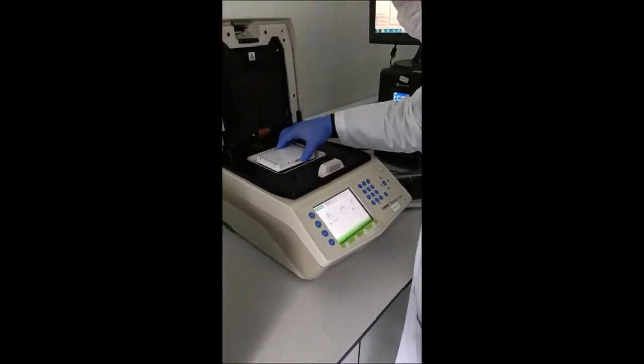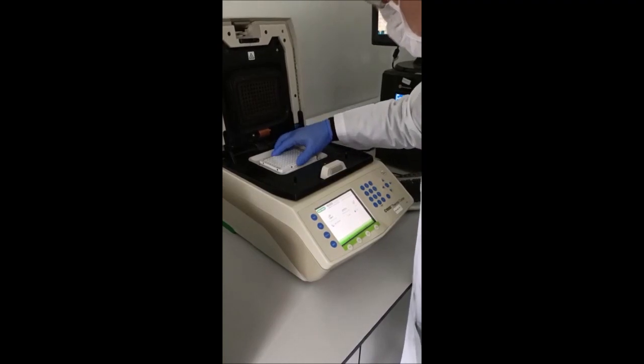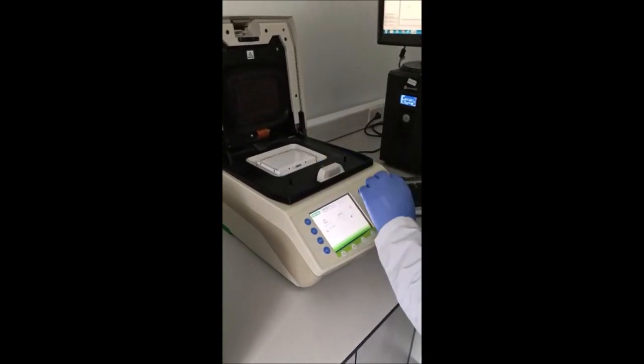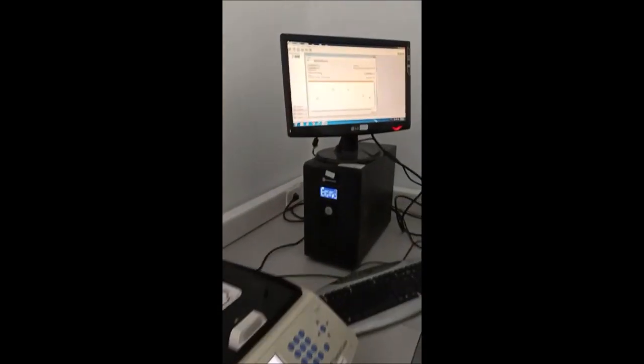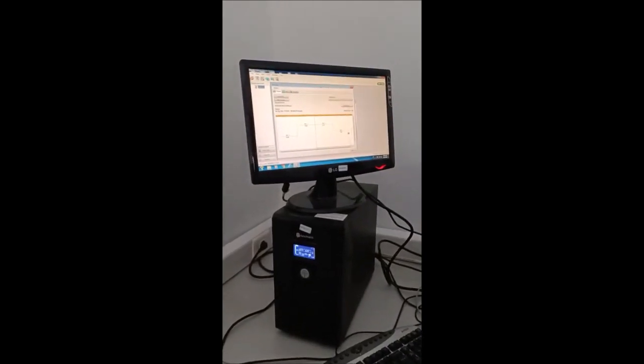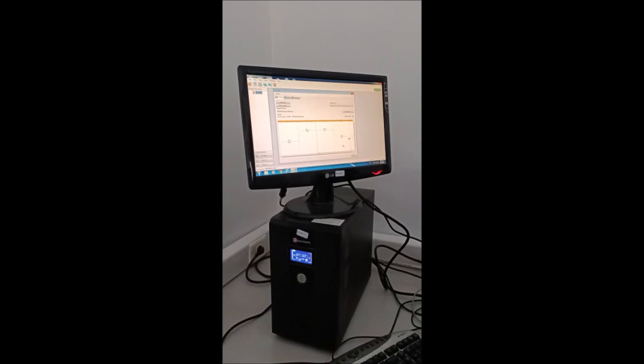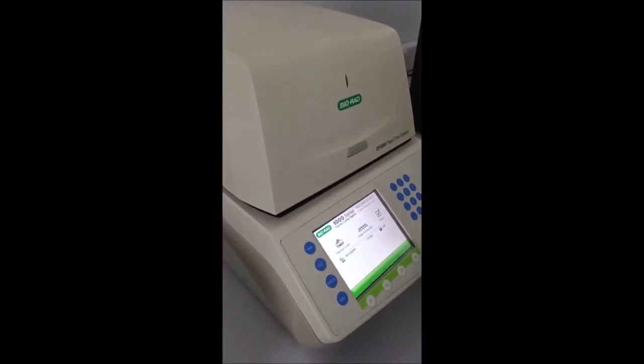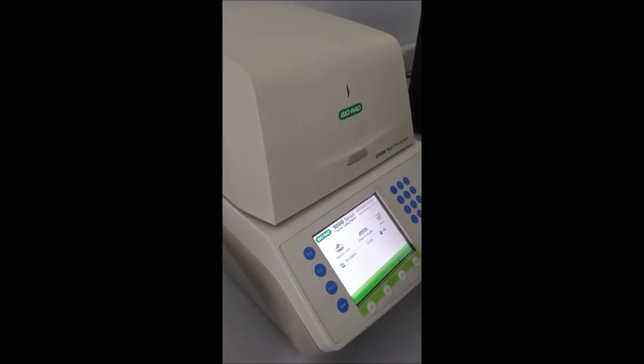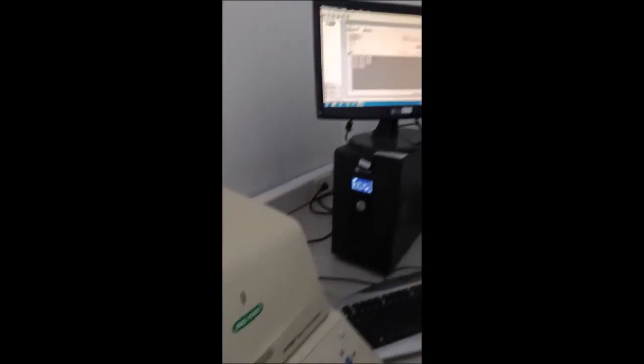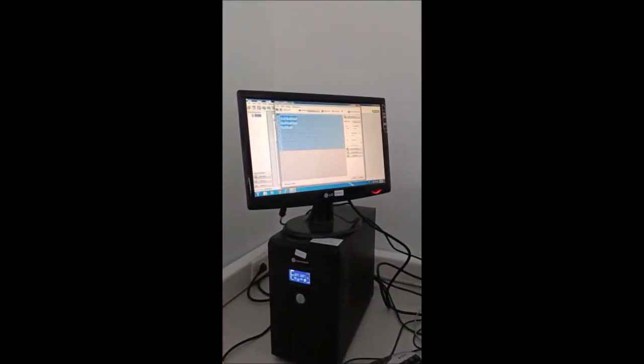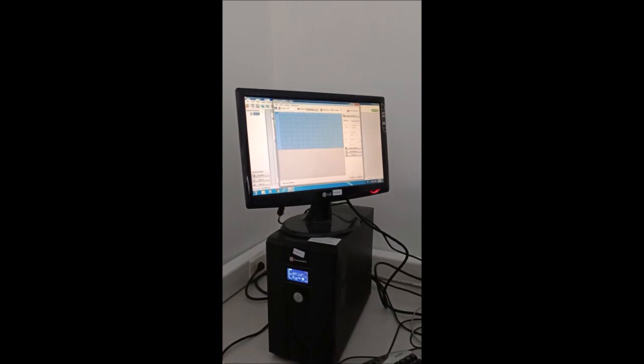We are putting our plate into the PCR instrument, selecting the correct protocol, and now we are selecting the samples.